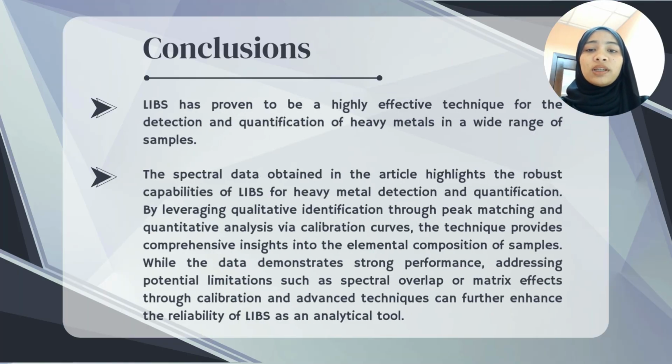Therefore, in conclusion, LIBS has proven to be a highly effective technique for the detection and quantification of heavy metals in a wide range of samples. The spectral data obtained in the articles highlight the robust capabilities of LIBS for heavy metal detection and quantification.